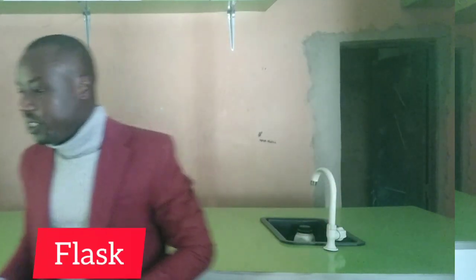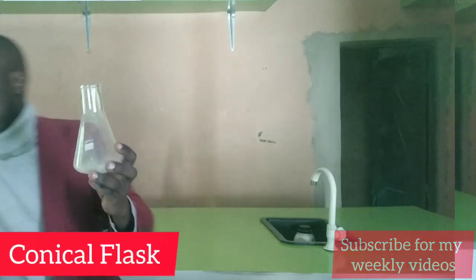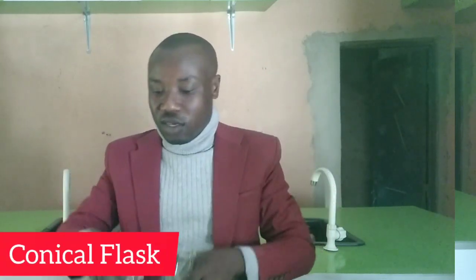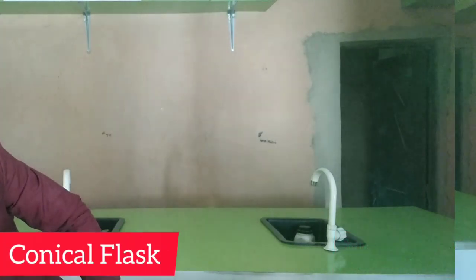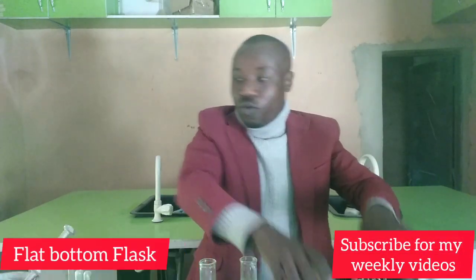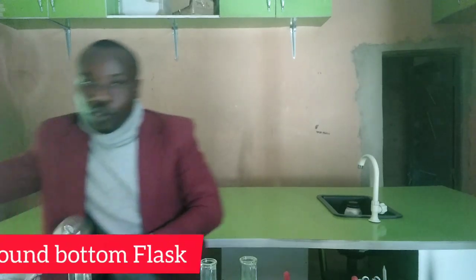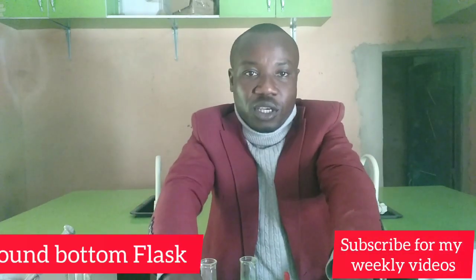Let me show you different flasks. This flask is what we call a conical flask. We also have another one that we call a flat bottom flask. It can stand. The next one I'll show you is called a round bottom flask. I've taught you the uses of it before. It cannot stand on its own; it will fall over.